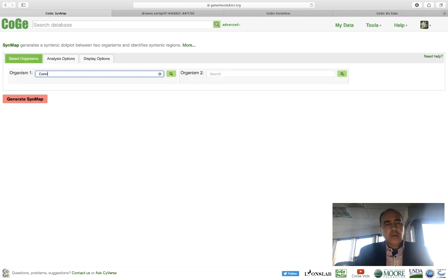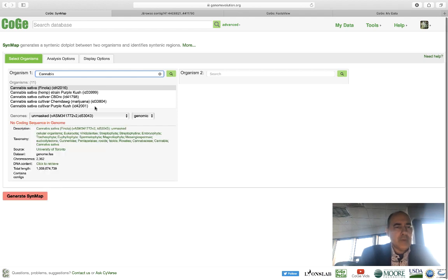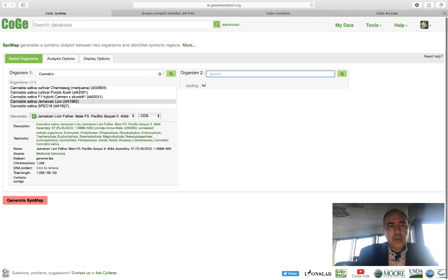So if you just go here and go cannabis, it's going to bring you up a lot of different versions of cannabis. And let's take Jamaican Lion as organism 1, and then let's do the same over here. Cannabis.